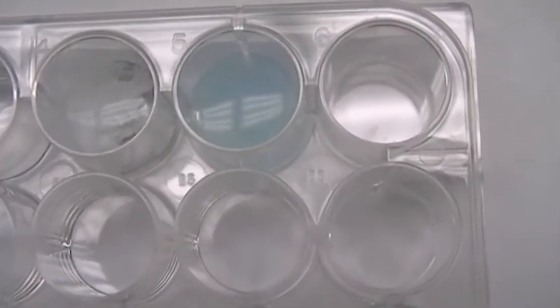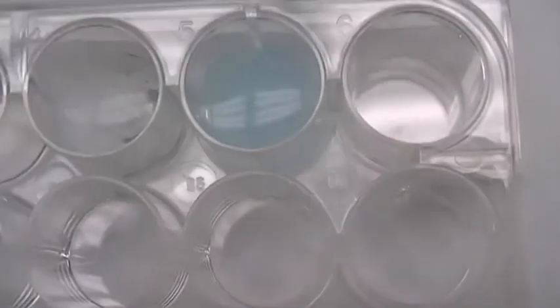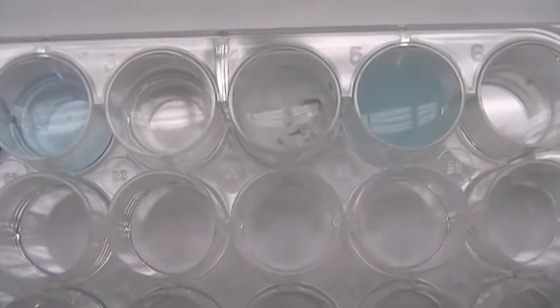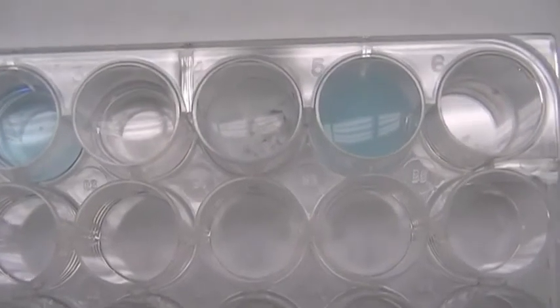It is not a lot of precipitate, probably hard to see in this video, but you got a little bit. It is cloudy, much cloudier. If you see the 2 blue solutions, you have the clear solution that is pure copper nitrate, and then you have the cloudy copper nitrate with 1 drop of silver nitrate.